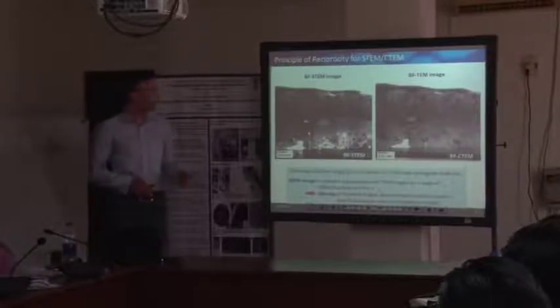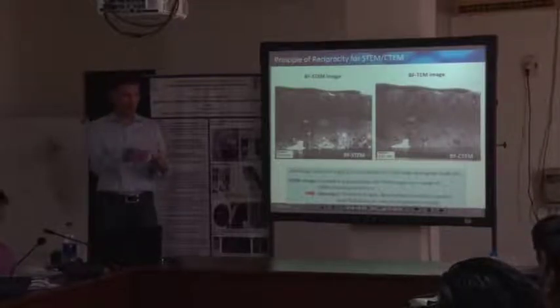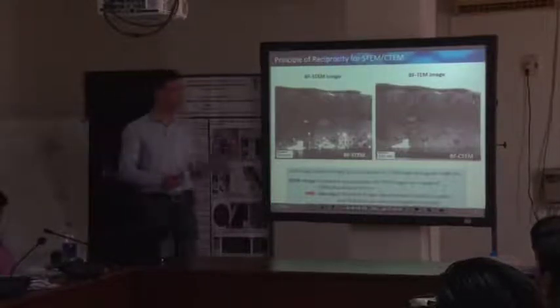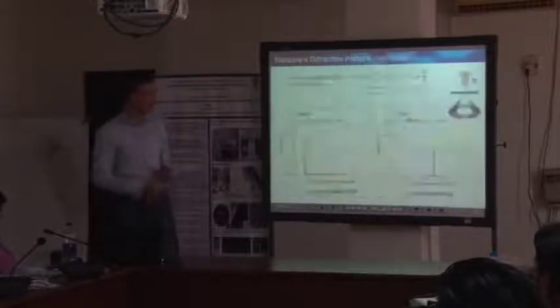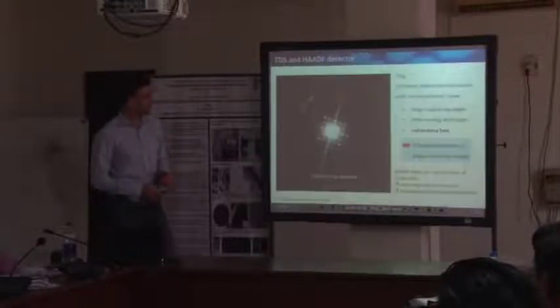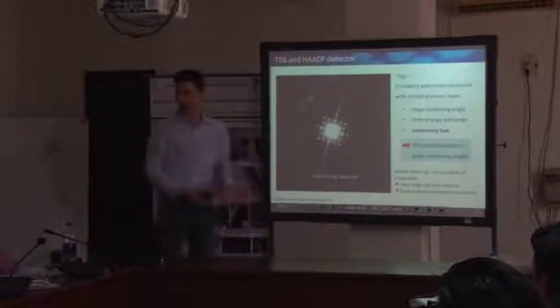And you will see, many microscopes only have one angular detector available, which you make use of for both annular dark field and high-angle annular dark field imaging, just by adapting the camera length in your microscope. So meaning we're just zooming the diffraction pattern in and out, because it's cheaper.